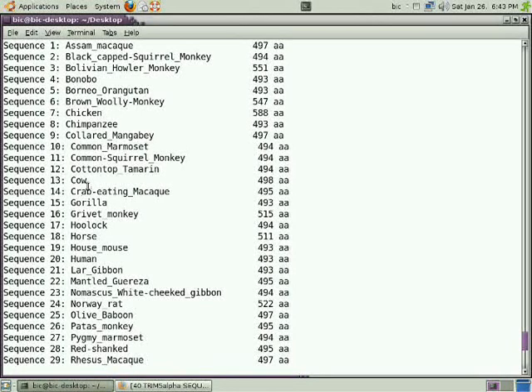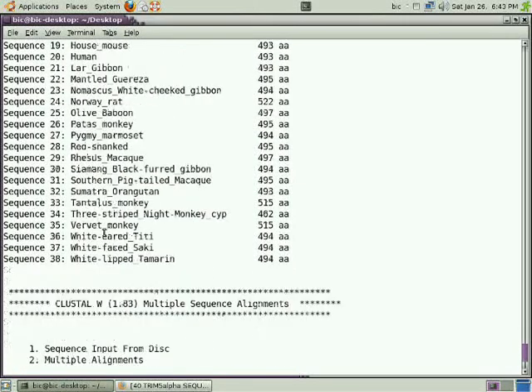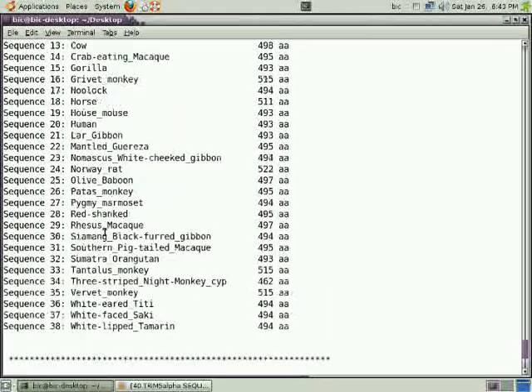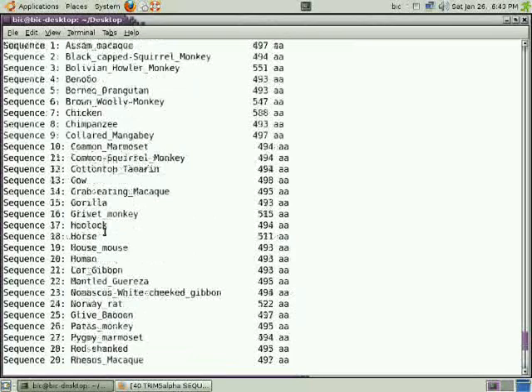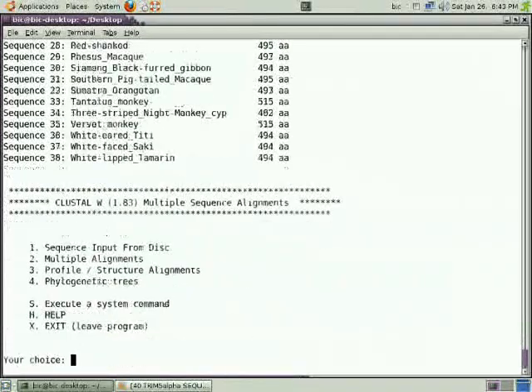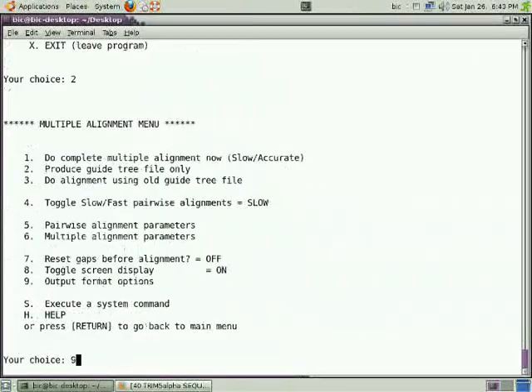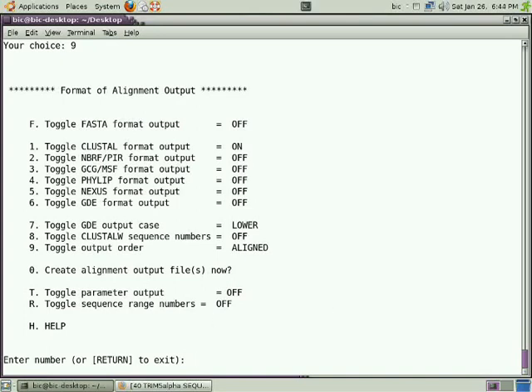Then after inputting the sequence, you should go to number 2: doing multiple sequence alignment. After giving your choice, just press enter and you will be asked for choosing your option. Go to option 9 so that you can set your output parameters - what output you want. You can get the output in different formats.